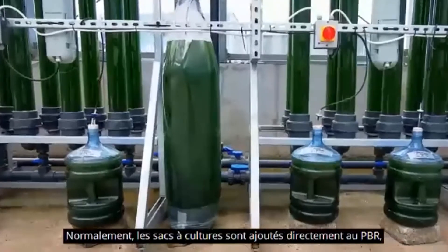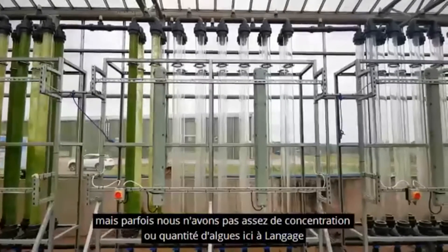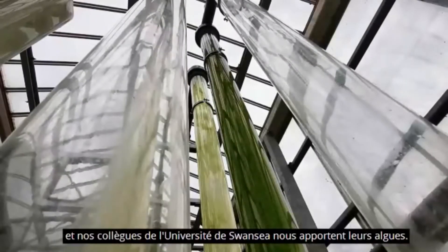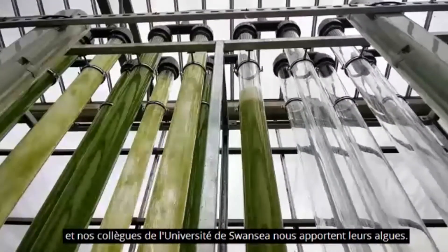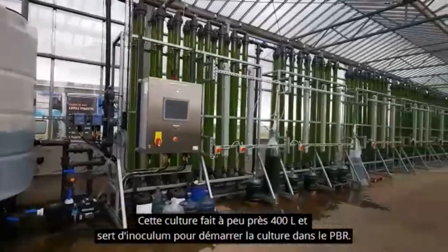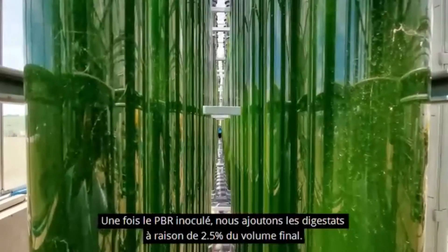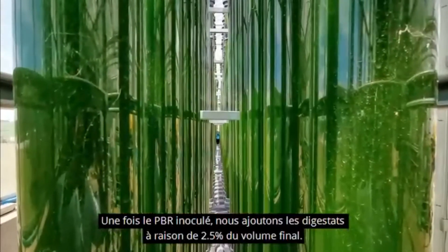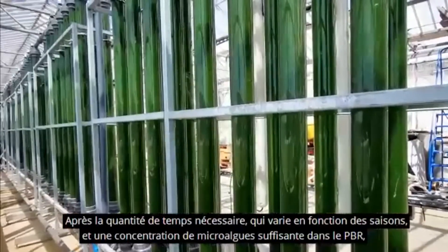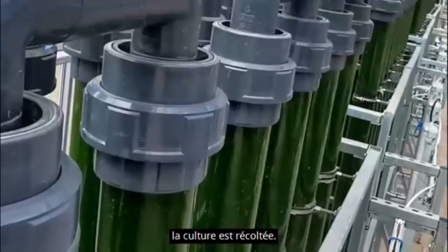Normally for the inoculation, the culture bags seen above are added directly to the PBR. However, sometimes we don't have enough concentration or amount of microalgae here in Langage, so our colleagues in Swansea bring us the culture directly from the university. This culture is about 400 litres, which serves as an inoculum to start with the culture in the PBR. Once the PBR is inoculated completely or partially, we add the digestate to 2.5% of the final volume. After the necessary days — which may vary depending on the season — and with enough microalgae concentration within the PBR, the culture is harvested.